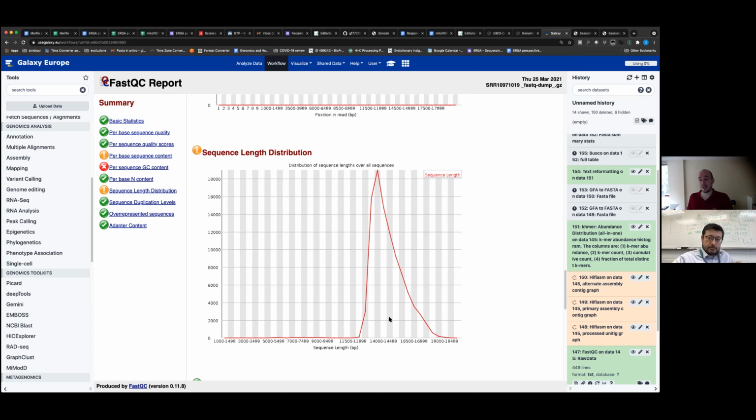It depends. This is being used not just for genome assembly, but also to sequence amplicons. So if you have, say, a region of interest that is 2 kilobases, you can generate amplicons of 2 KB and then only sequence those with PacBio. And of course, your peak would be around here.